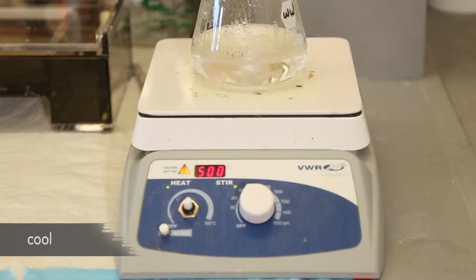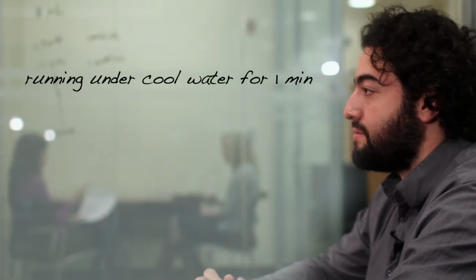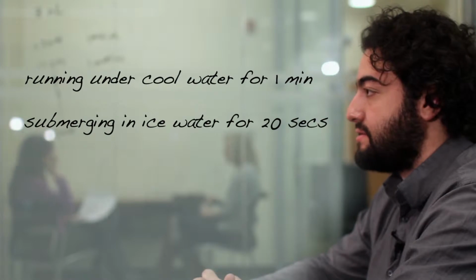Cool the flask until it is cool enough that it can be handled comfortably in a gloved hand for 60 seconds. If the gel cools too much, it will not pour evenly, and it is better to err on the side of too hot rather than too cold. We find that cooling the gel by running cool water over the flask for about a minute or by submerging it in ice water for 20 seconds tends to provide quick and adequate cooling.